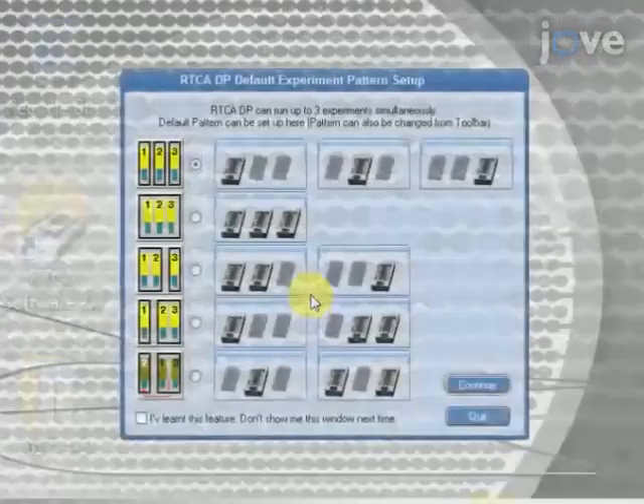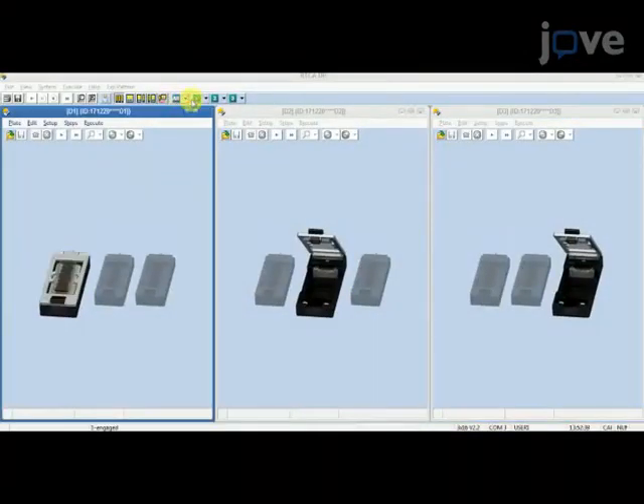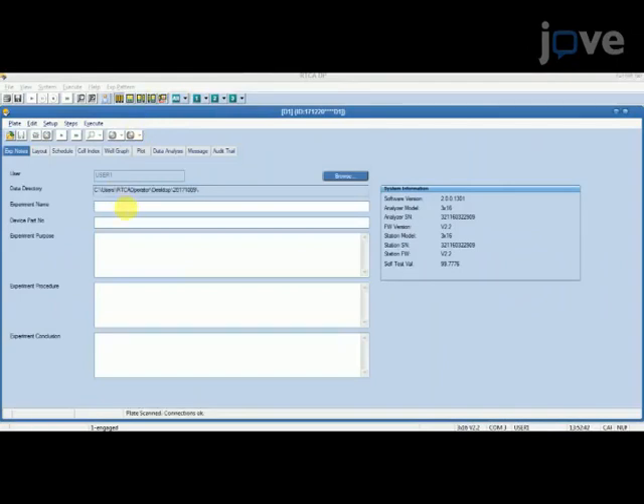Next, launch the real-time cell analyzer operation program on the computer. On the default experiment pattern setup page, select experiment model and name the running assay.